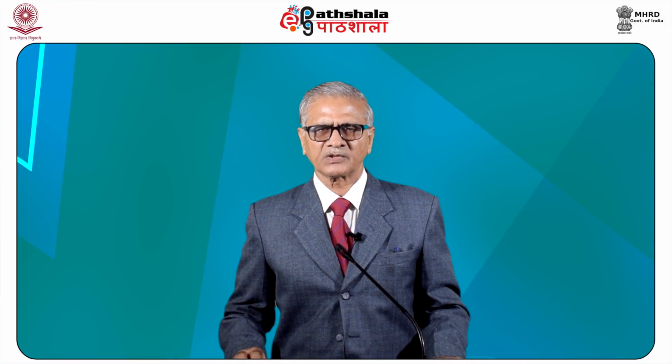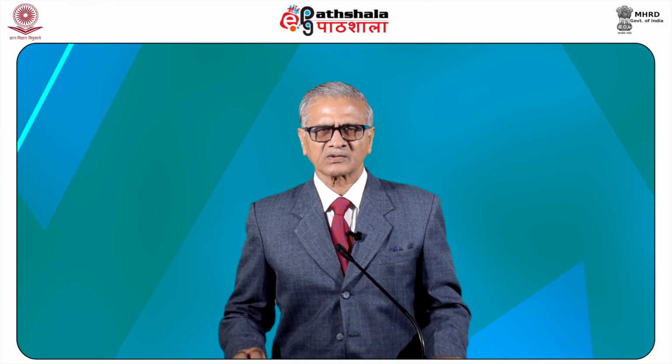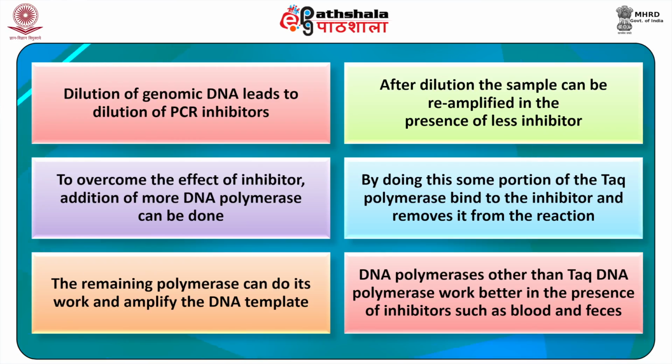The following solutions can be used to remove PCR inhibitors or reduce their effect. Number 1, dilution of genomic DNA leads to dilution of the PCR inhibitor. After dilution, the sample can be re-amplified in the presence of less inhibitor. To overcome the effect of inhibitor, addition of more DNA polymerase can be done. By doing this, some portion of Taq polymerase binds to the inhibitor and removes it from the reaction. The remaining polymerase can do its work and amplify the DNA template.